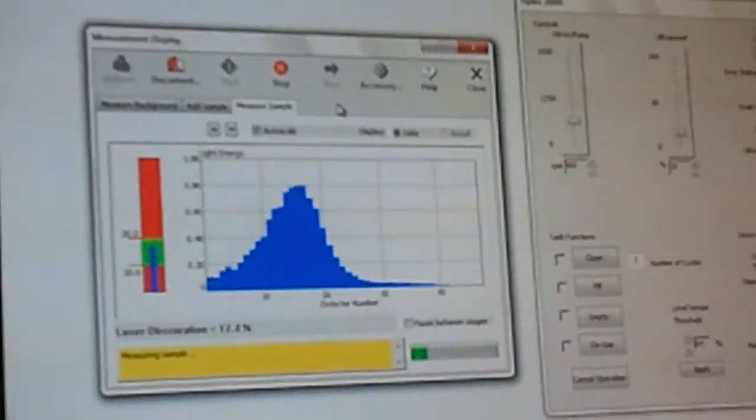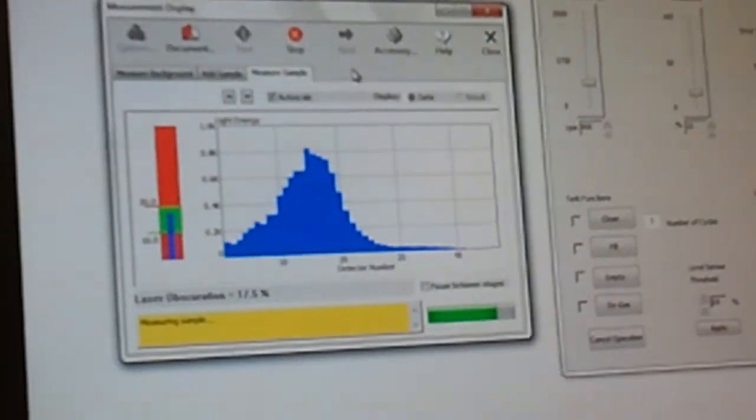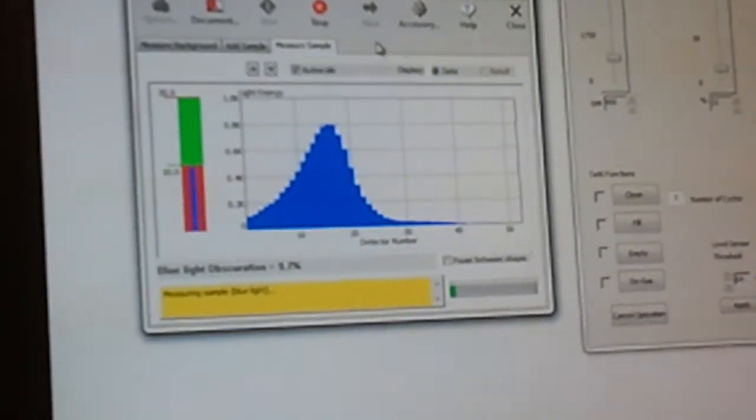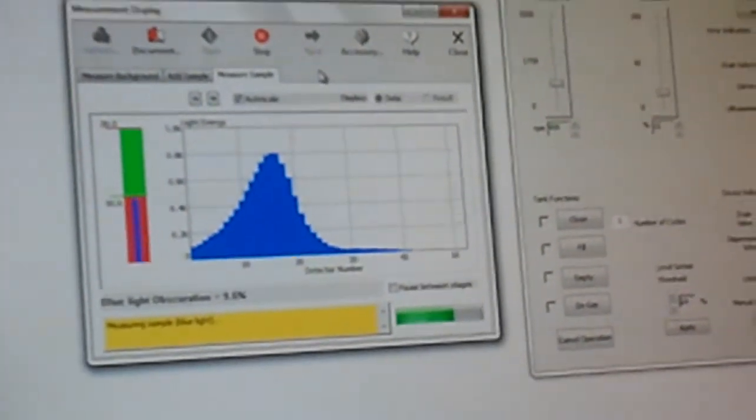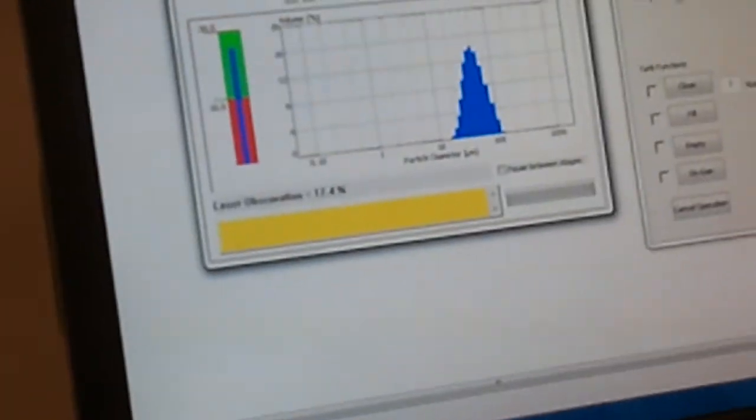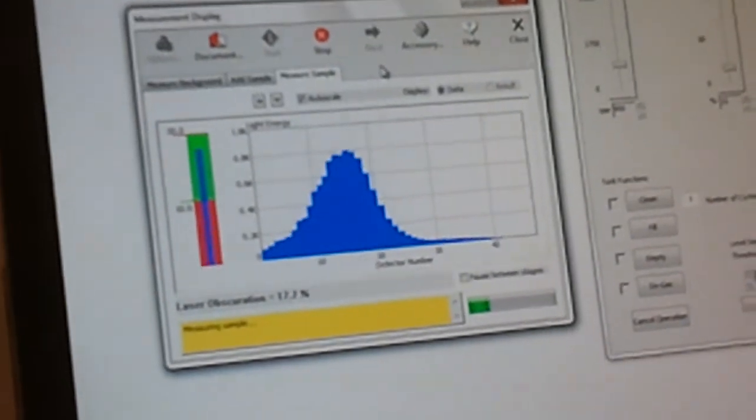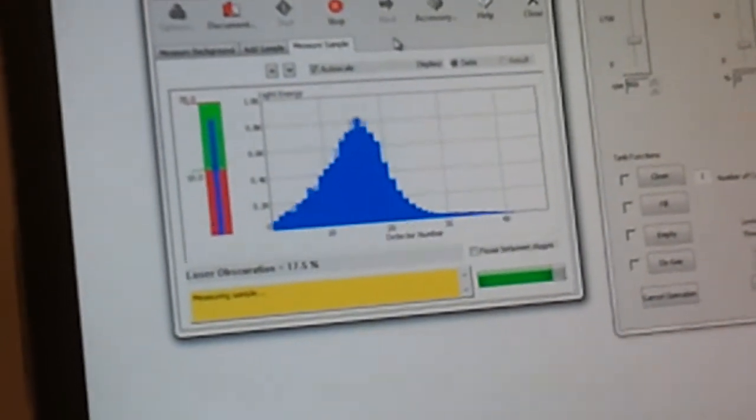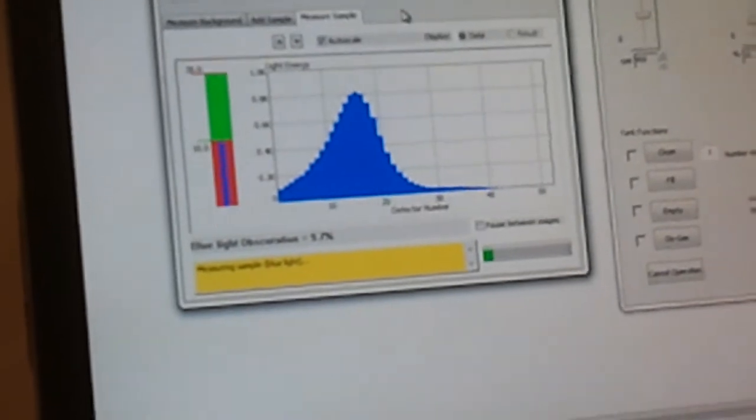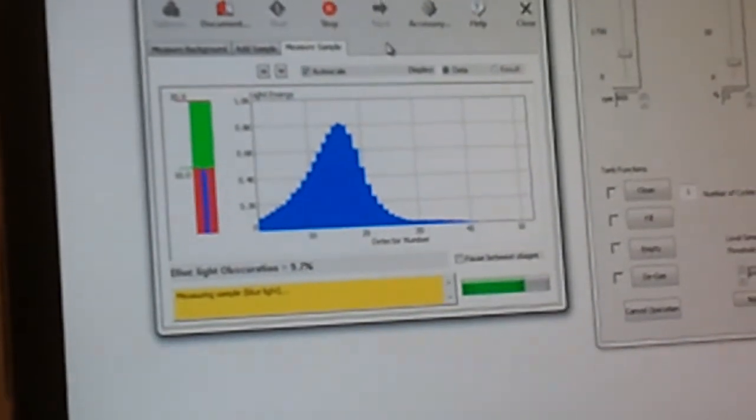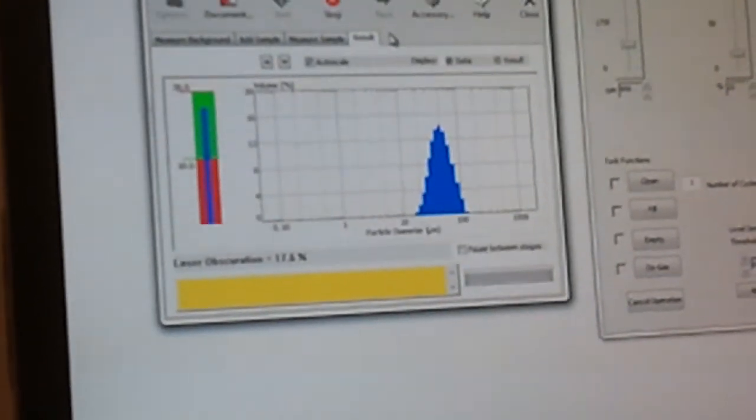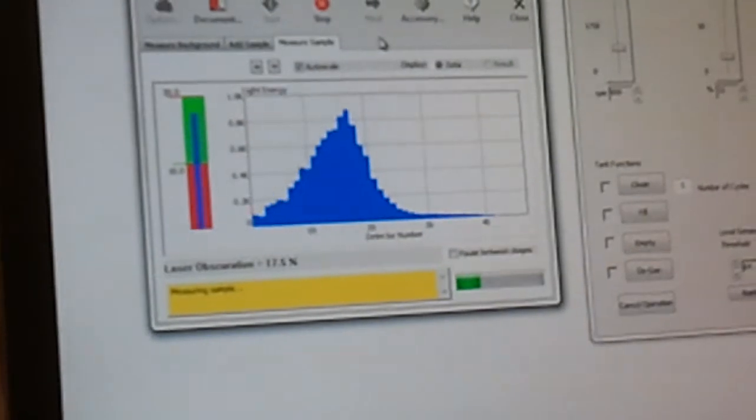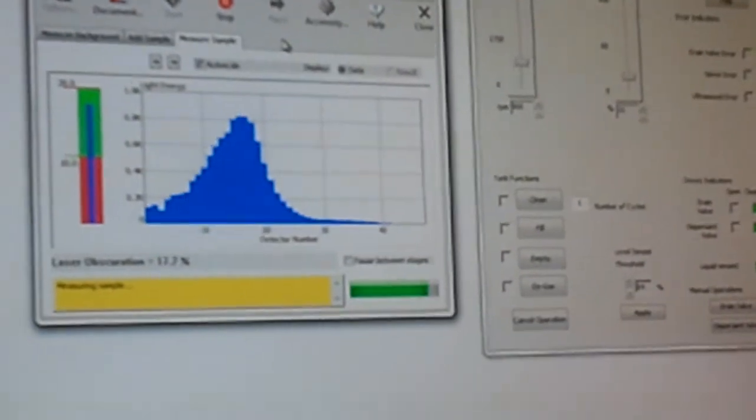Now it's gonna do the run. And I would recommend that you do it with water a couple of times before I try the alcohol. Yeah, that's the thing to do. So the blue light is just below the limit. So that was once. It's doing it three times. So the green thing three times. It's doing the whole measuring three times. That's the second time? Yeah, this is the second time. And at some point it will come back to the third time. So this is the third time? This is the last time, yeah.